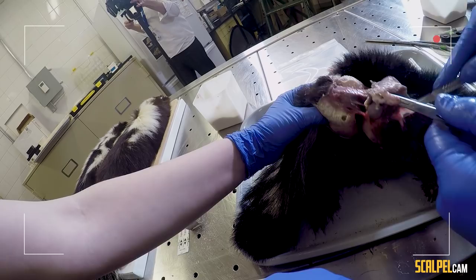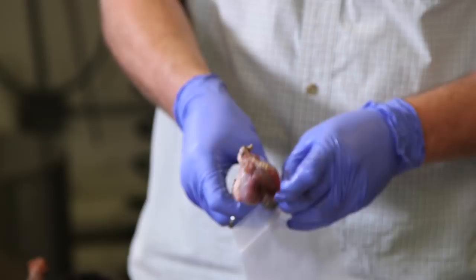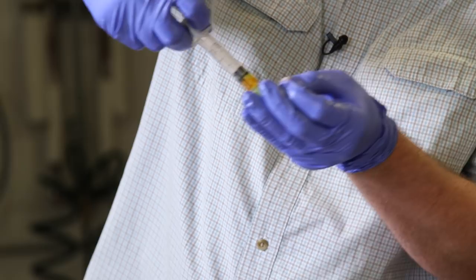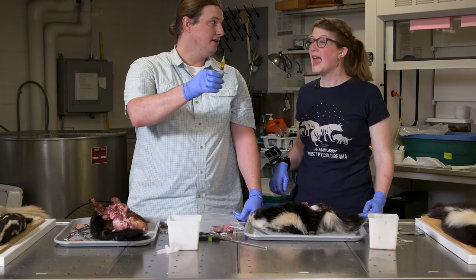There they are — garlic ping pong balls number two. We're going to extract some of the spray with a five-milliliter syringe. That is foul. You can see partially how the myth got started that skunks were urinating on you — early people used to think they were peeing on you. If your urine smells like that, you need to see a doctor immediately.